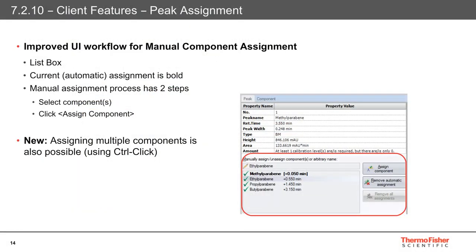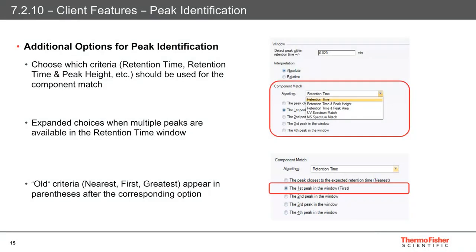The process of assigning components manually has now been made simpler with a new and improved user interface. The layout is more intuitive with the current automatic component displayed in bold, and you can also use a control key to assign multiple components from the associated list. In previous versions of the software, we could apply identification criteria to manage cases where the retention window of a component included multiple peaks. These criteria were the first peak in the window, the nearest peak closest to the expected retention time, the peak with the greatest height, or assignment using the UV and MS spectrum matches. This release expands the criteria to include the second, third, or fourth closest in terms of retention time, greatest in relation to peak height, and largest peak in terms of area in the retention time window. The additional criteria will give the user more flexibility when looking for a positive and accurate match for peak identification.